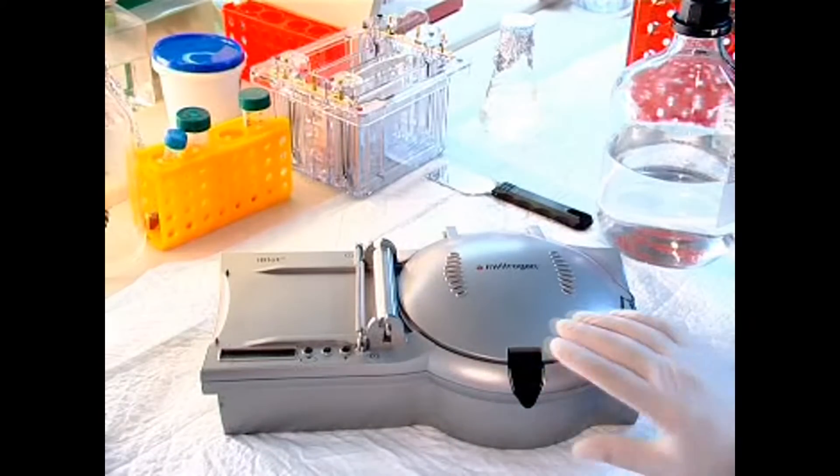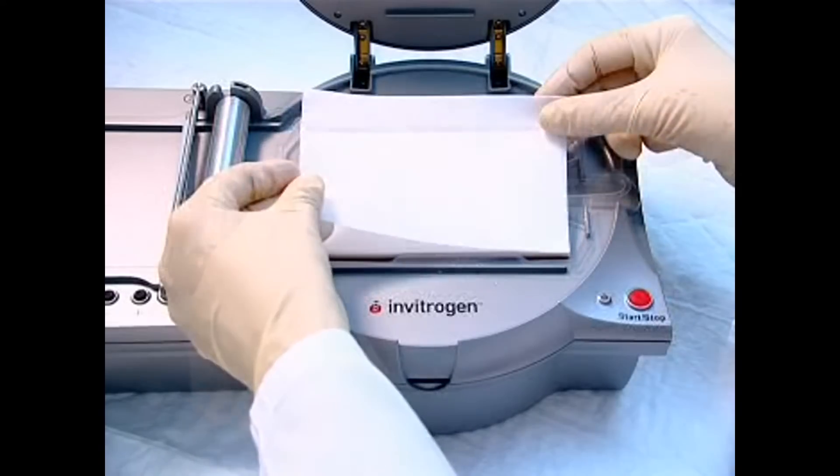All this changes with the new iBlot dry blotting system from Invitrogen.